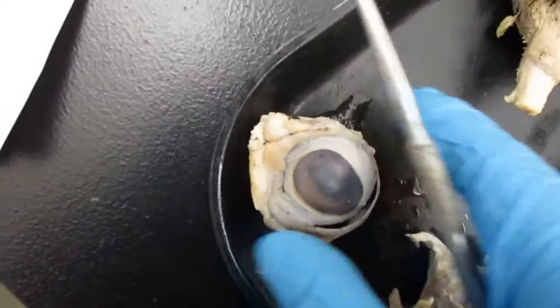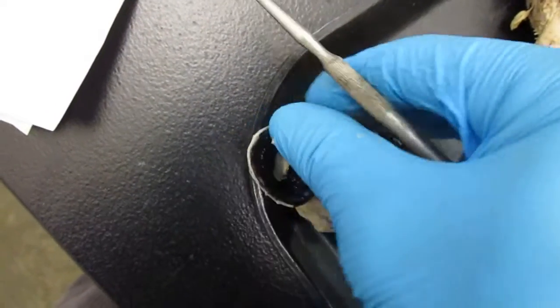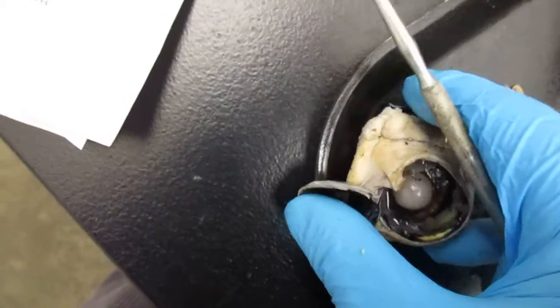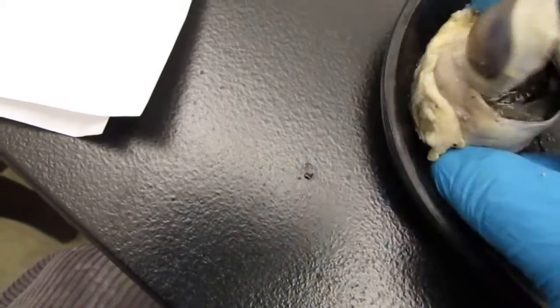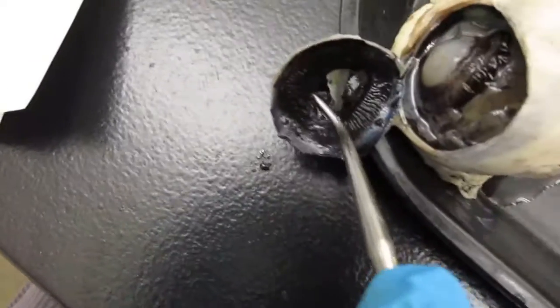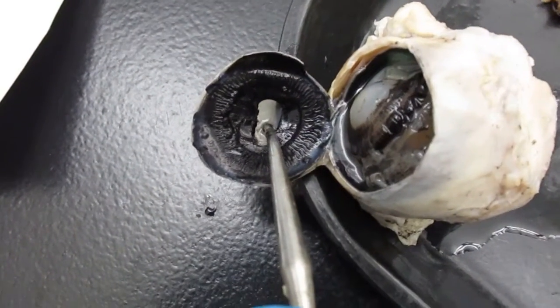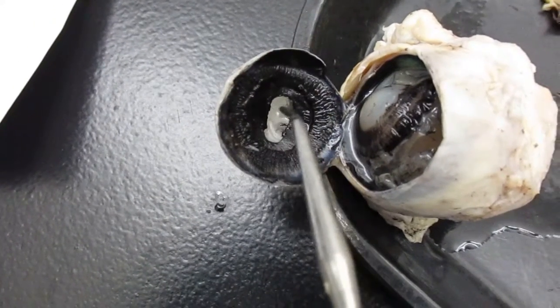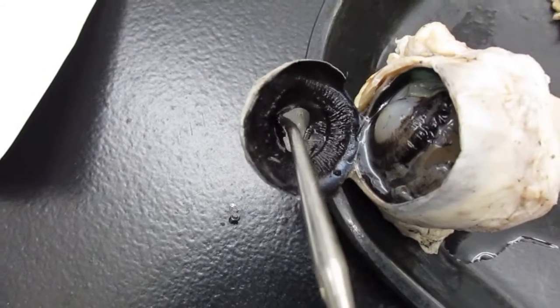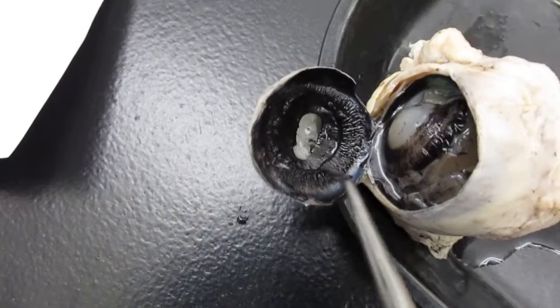Okay. Now, here I've opened this up. I've cut through the sclera, and I'm going to show you some things here. So I'm just going to hope this stays put, which is not appearing to be going to stay put. So you see where the probe is right there? That's the pupil. So the pupil is right here, and this ring that's around the pupil is called the iris.